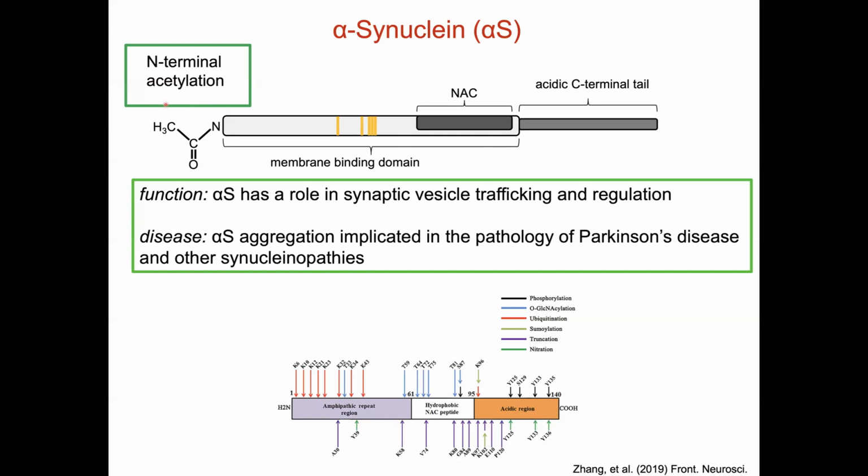So my lab was quite lucky in that around the time we became interested in N-terminal acetylation, the Mulvihill group was interested in N-terminal acetylation of tropomyosin, and they created a construct where you could co-express the NatB complex, the N-terminal acetylase enzyme complex from yeast, in a bacterial system, and it would acetylate your protein during synthesis, and you could purify acetylated protein. We got the plasmid for this from them, and we found that it worked beautifully with alpha-synuclein. So we could co-express this, and we would end up with synuclein bearing this N-terminal acetylation. And we were very excited.